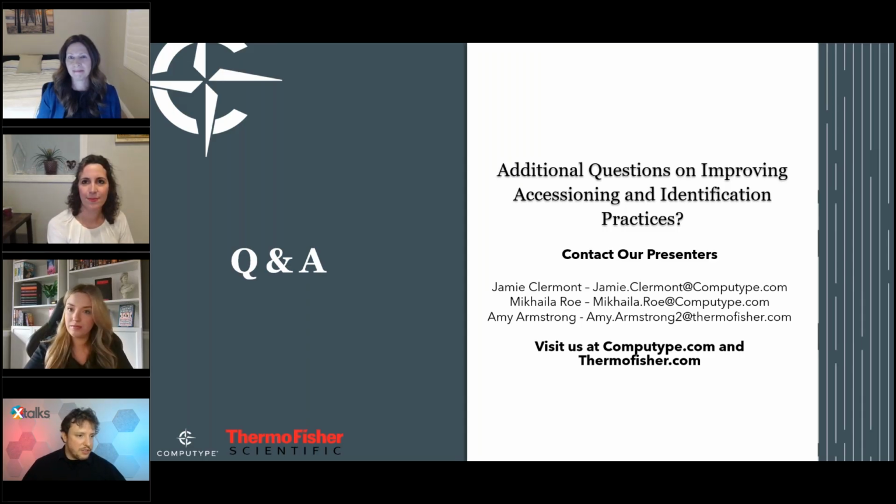Okay, very good. Thank you so much. For our next question here, it asks, what is the best way to easily track and identify samples so that they just don't get lost?